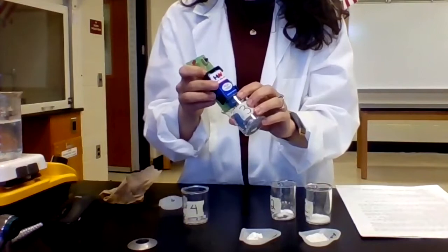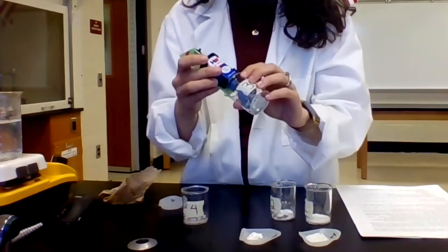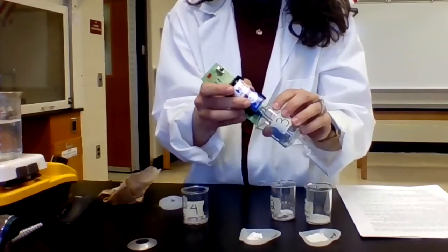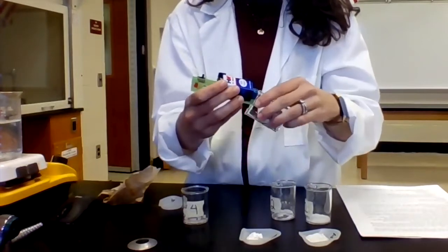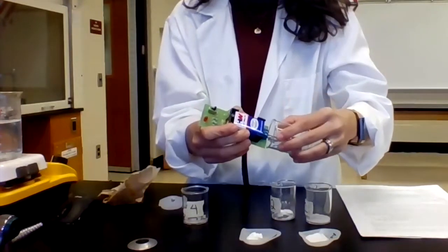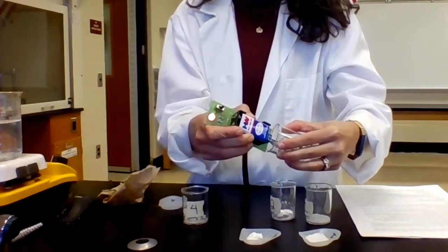Now this I can get to touch, because the pieces are a bit bigger. So what you should see, if I can get good contact here. There we go. You see it's lighting up now, right?